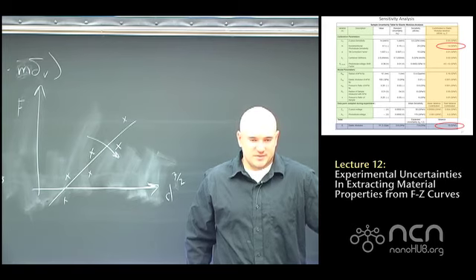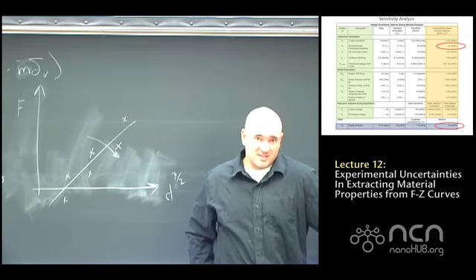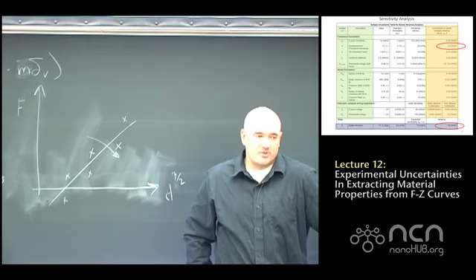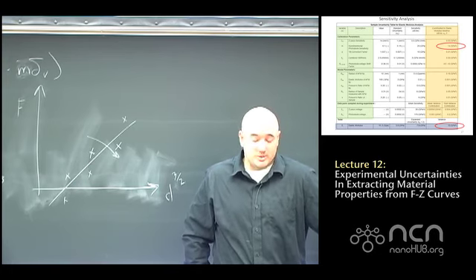This is a situation that's unique when you're talking about a nanometer or less of indentation. If you start talking about larger indentations, for example, an experiment on cells where maybe it's 500 nanometers of indentation, it's not such a huge issue. It's unique to the case study that I've done.